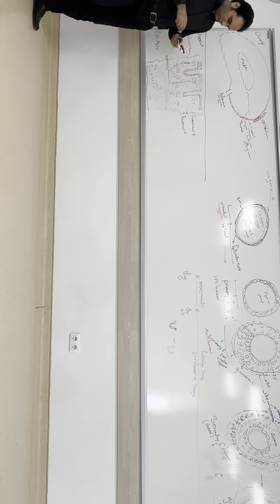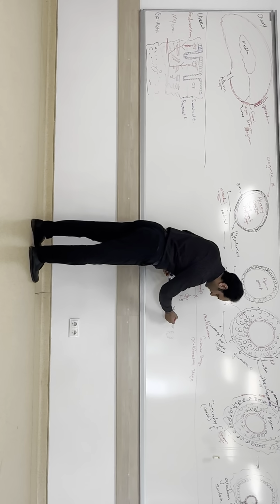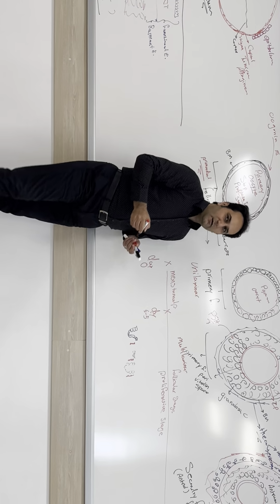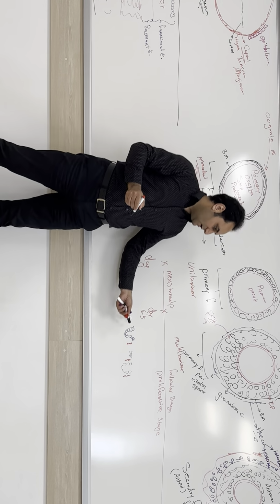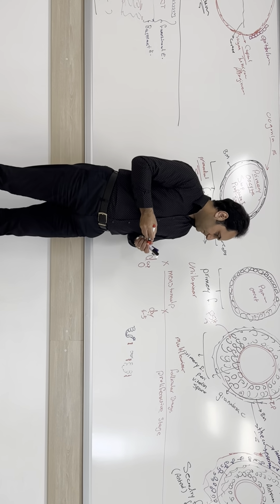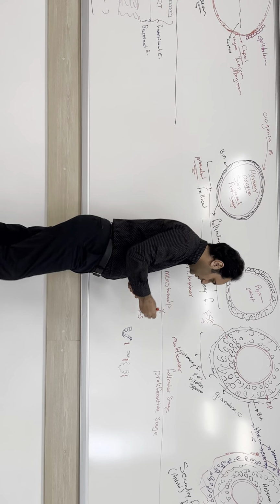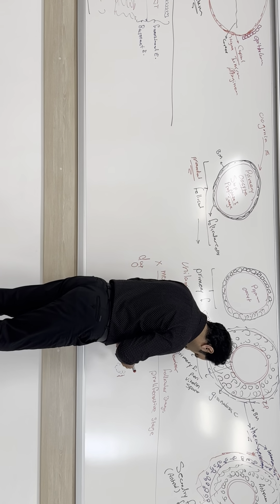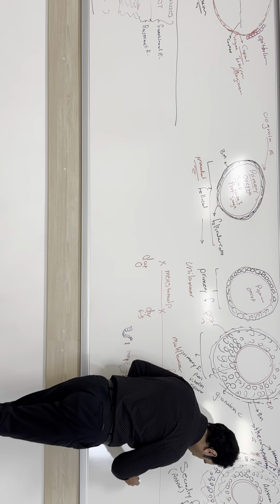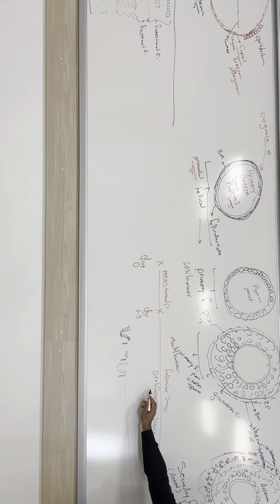How does this returning occur? In the basement part, we have stems of spiral arteries and glands. From the stems of spiral arteries and glands, the cells in this part start to proliferate and form the normal surface of the endometrium during the stage of proliferation.